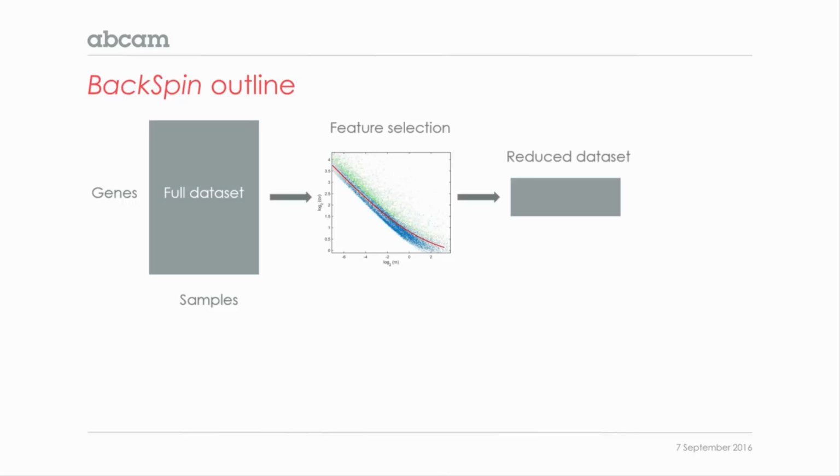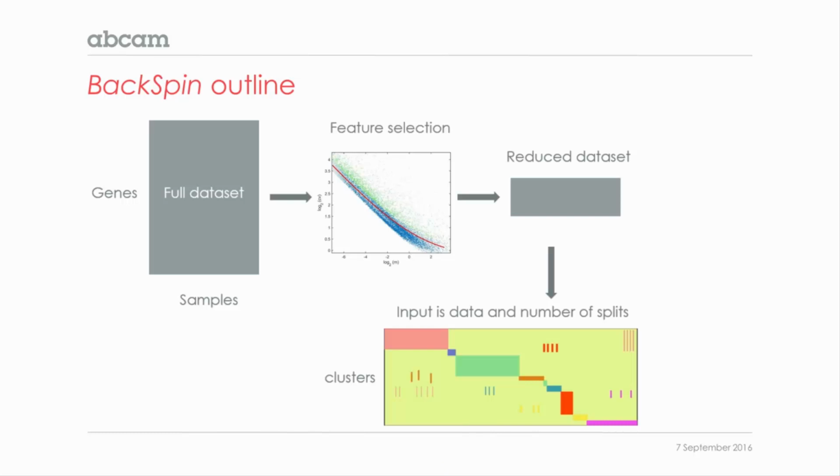After you did the feature selection, you get a reduced data set. That means you go from 20,000 genes to whatever, the top 1,000 genes or 3,000 genes. And then you can start doing your analysis. The goal is to take this reduced data set and create clusters, something that you can look at, basically grouping the similar cells together and the similar genes together. Then you can start to look at the data.